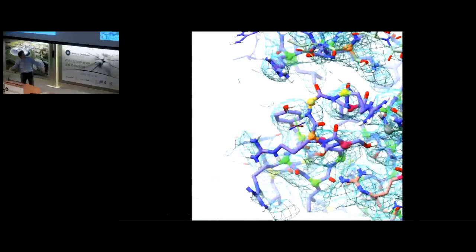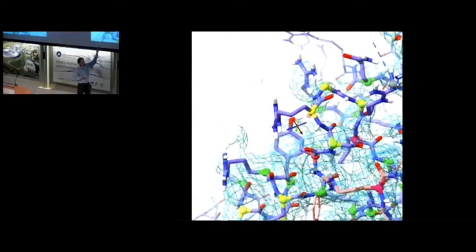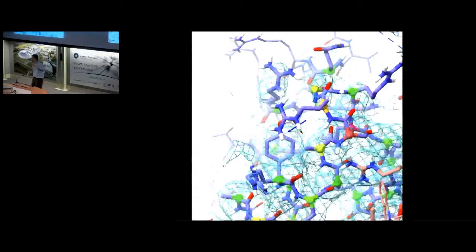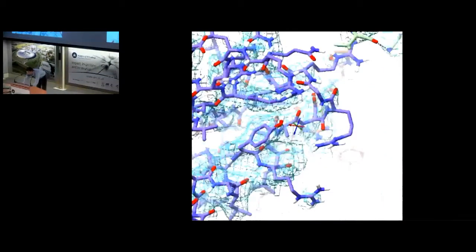And something I haven't mentioned is that in all of these simulations, I have restraints in place that will keep the peptide bonds in their current cis or trans conformation until you tell them to be otherwise. So any of these you can flip on command.